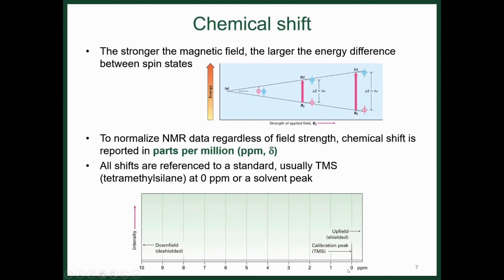And from this, we picked this very electron-rich compound called tetramethylsilane, or TMS, which is often set at 0 parts per million, and it's usually our reference peak for our NMR spectrum. By convention, this is set to be 0 parts per million, and that's because the majority of organic compounds come to the left on this x-axis, as they usually come downfield of most NMR signals from this. And so having this reference scale and being able to scale for different spectrometers allows us to look at NMR data across many different instruments and compare them systematically.